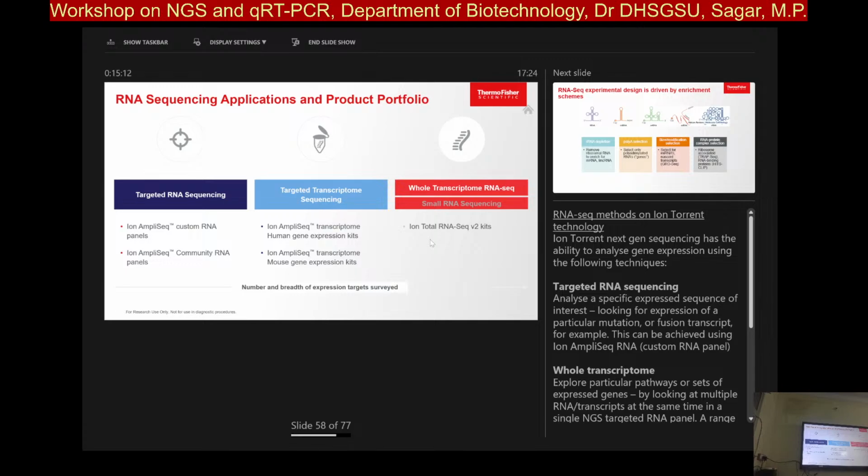With that, small RNA. So small RNA would be miRNA that you are targeting, right? You can follow certain steps that allow you to amplify or pick small RNA from the samples, and use those amplified or picked DNA products to go further with sequencing and get the outputs. And with the same output you follow certain steps for doing the analysis. Okay. So small RNA, of course, what would it help you with? Knocking out genes, right? So take those studies further. The gene is working, knock it out, and then look further at what is happening in the sample.